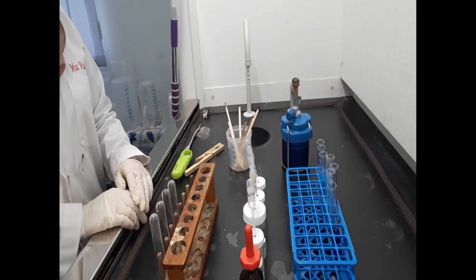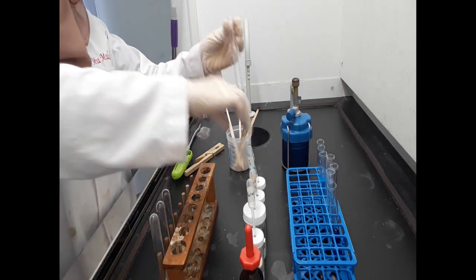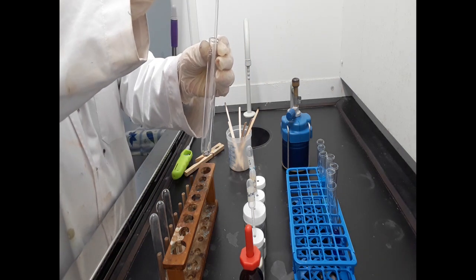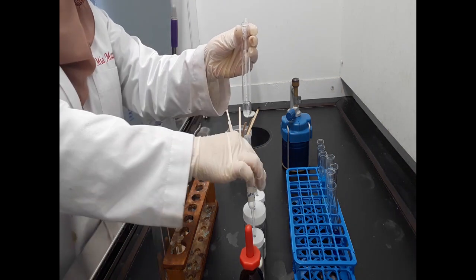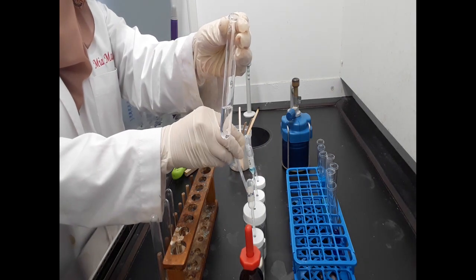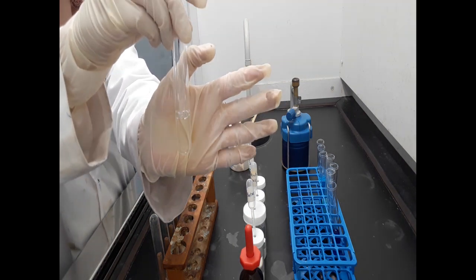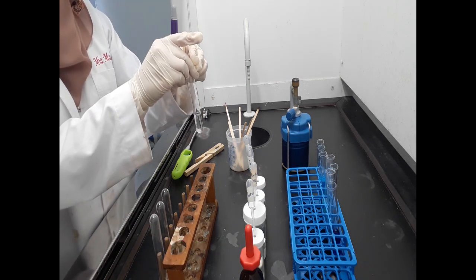So on to the final question. To 1 centimeter depth of a solution in a test tube, add an equal volume of dilute nitric acid. So add 1 centimeter cube of solution R and add an equal volume of dilute nitric acid. No reaction is observed.